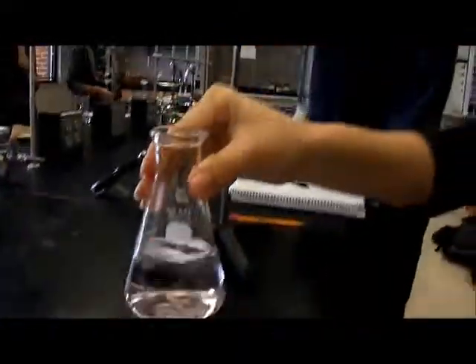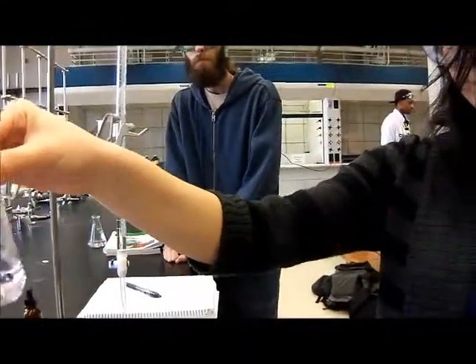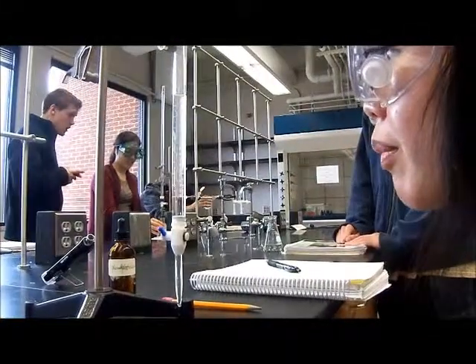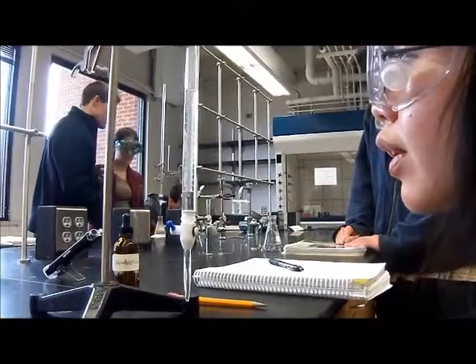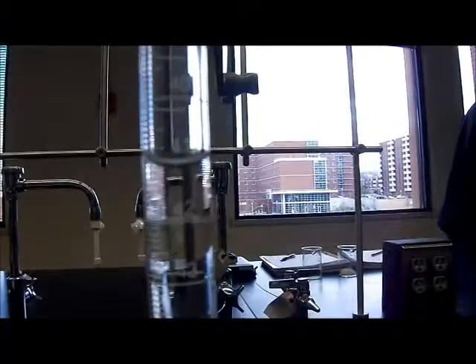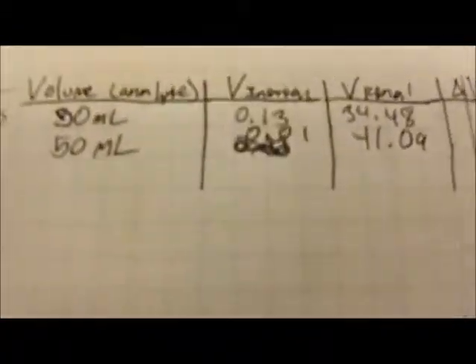Perfect. Okay, now Whitney's going to record her final volume. 41.09. Okay, now Whitney's going to record it in her lab notebook. 41.09.